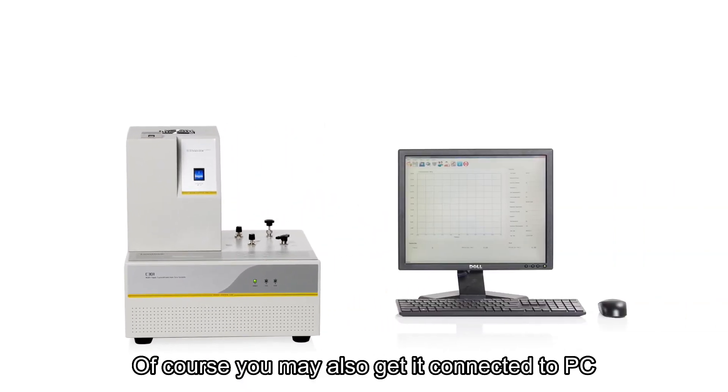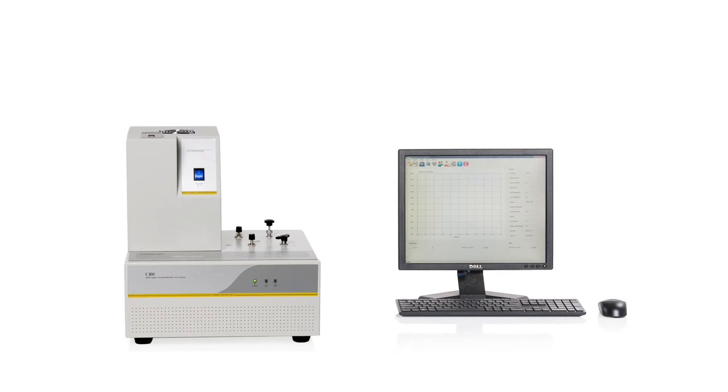Of course, you may also get it connected to PC. With the professional software that runs on PC, more powerful data analysis and data management can be achieved.